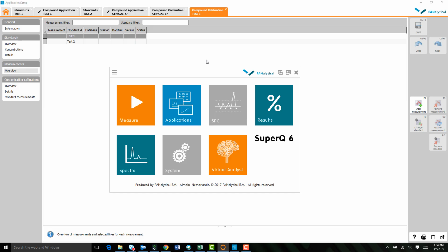And in edit measurement, you'll want to pick the position of your tray, which will be A1, or maybe B2 or whatever position that you have available there. Go to A1 and say type standard. Run your standards as standards, not as routines. Go ahead and put the application name in there.